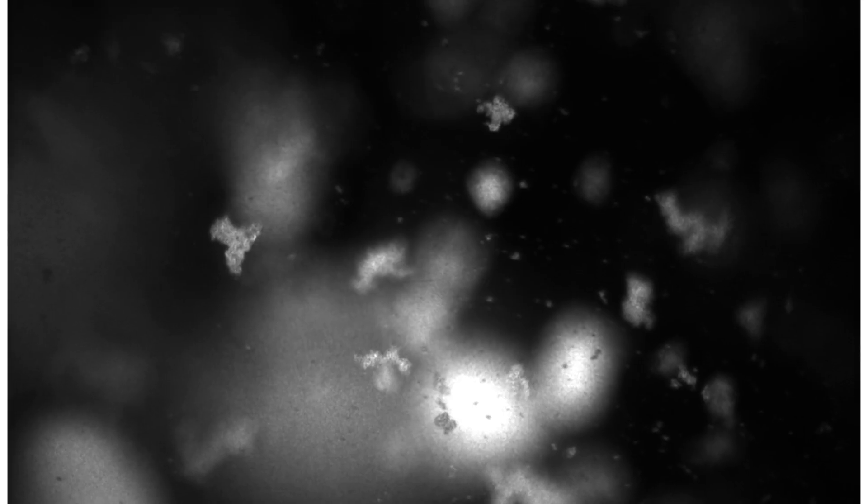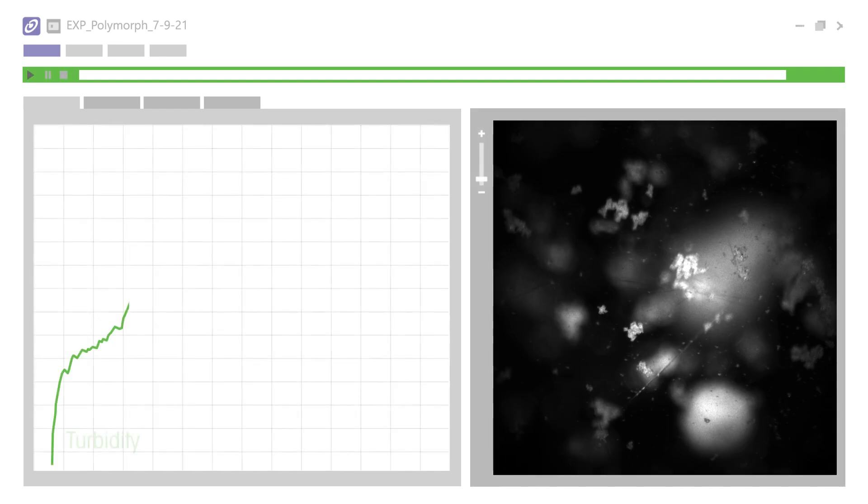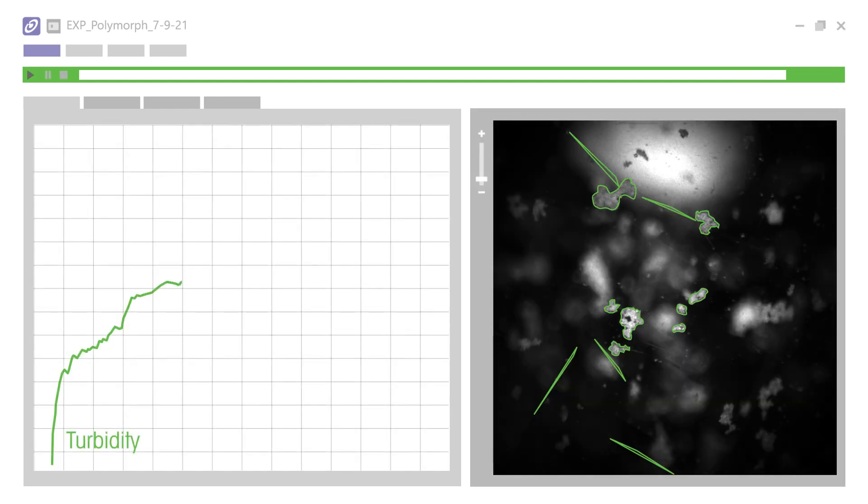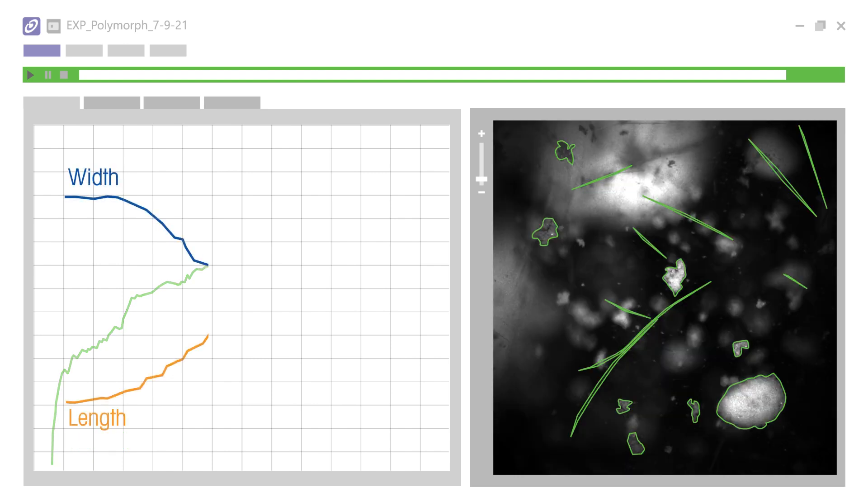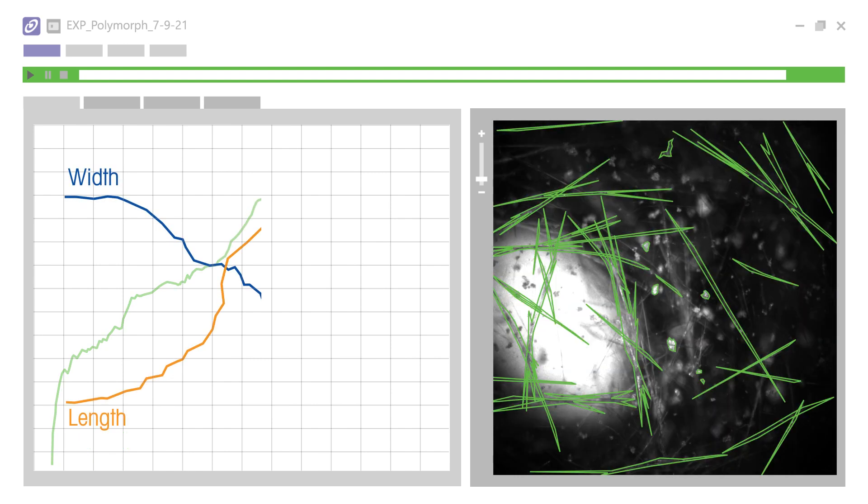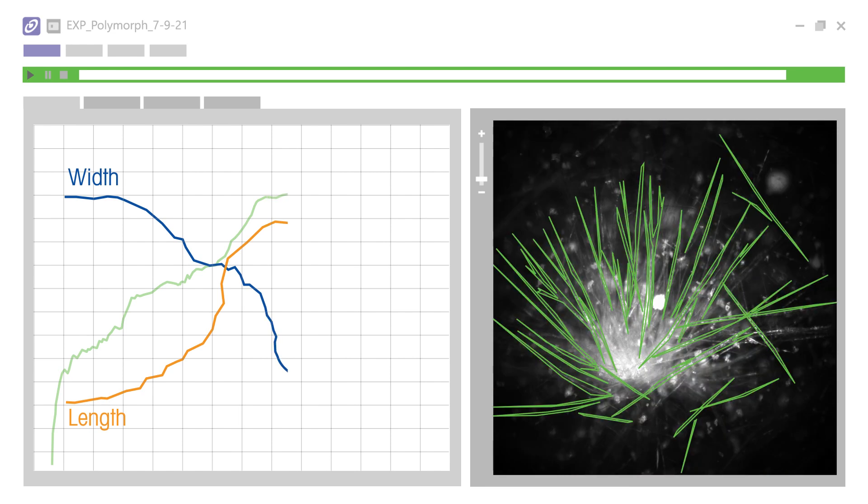EasyViewer provides an immediate understanding of particles as they naturally exist in process with submicron resolution. EasyViewer's turbidity trend is highly sensitive to system changes, and real-time image analysis measures particle size to track growth and shape changes that are impossible with offline techniques.